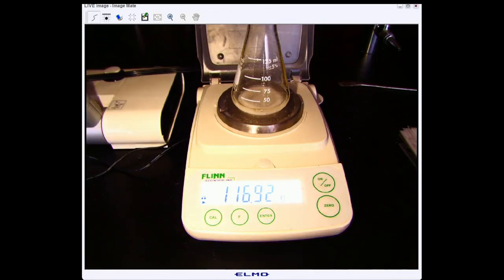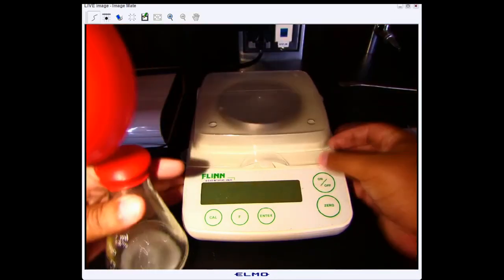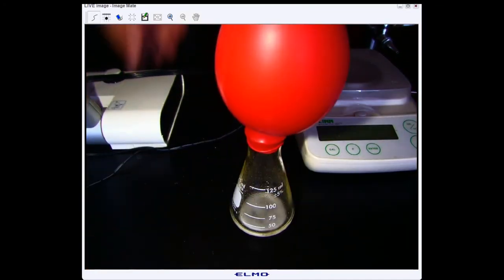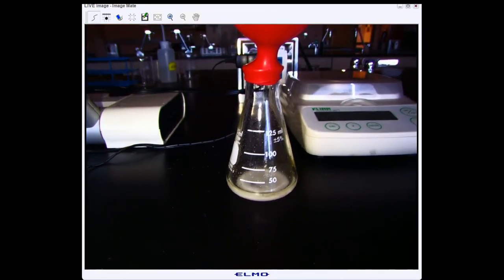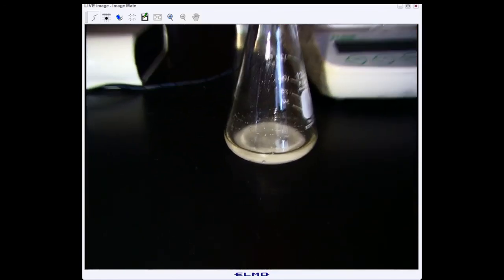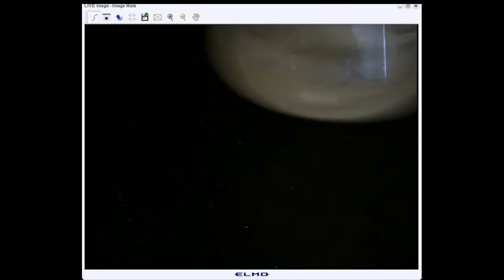All right, so now that the reaction is done, we're going to remove it from the balance and observe what's left in the container. So we got some gas to form, and we can see a little bit of the reaction is still happening. If we give that a swirl, we can see that we're left with a little bit of solid in the end.